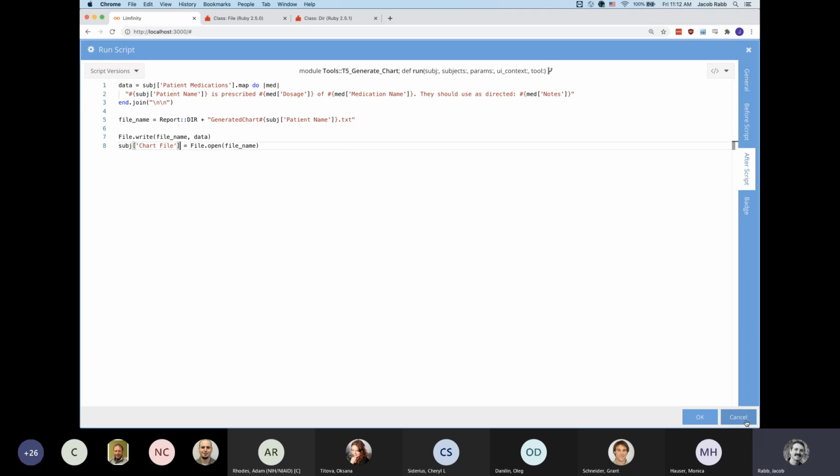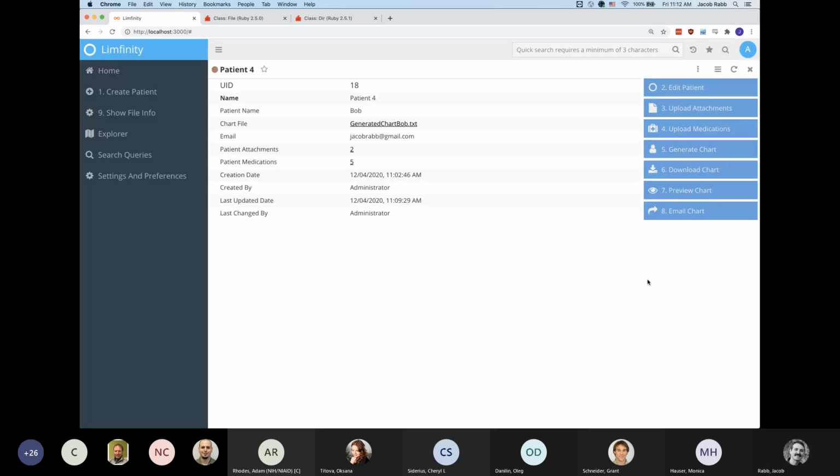All right, any questions on this example? Great. I'll move on to downloading a file.